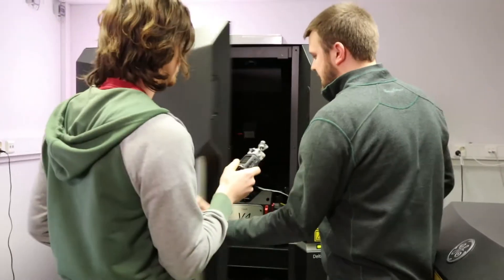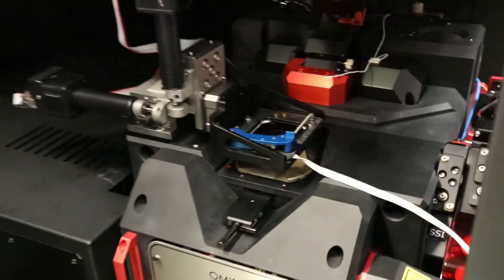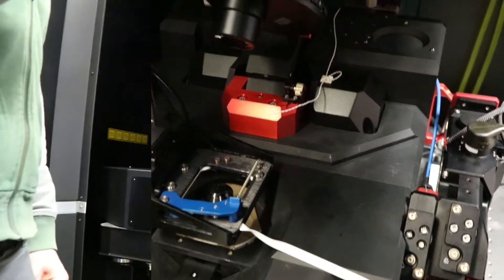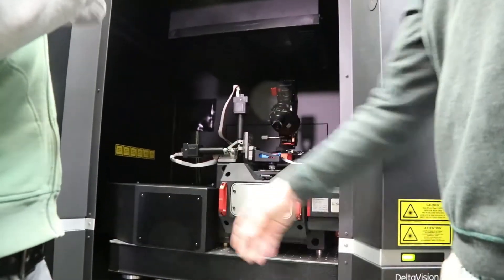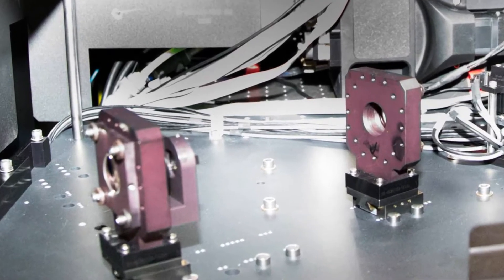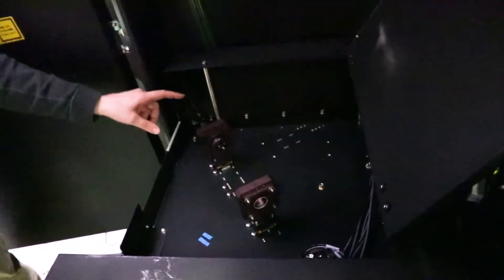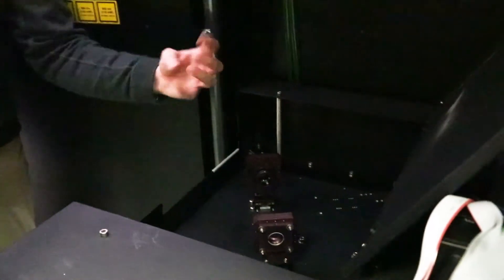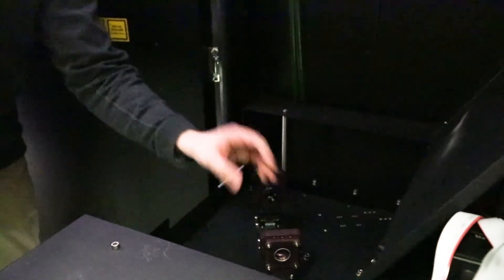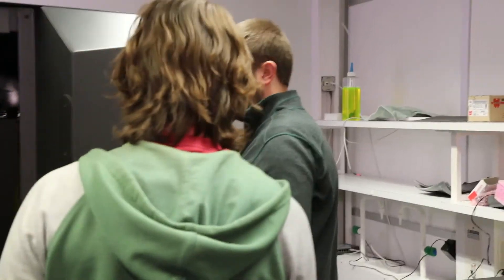This contains the actual microscope block. It's inverted — you put the sample directly onto the oil immersion objective. Underneath this big black dust cover is the SIM light path — structured illumination, that's our super resolution light path, or one of the super resolution light paths. Very high level overview of the SIM path: this is where the fiber optic comes in. The light comes out of here, goes through some lenses. There's a grating in here that splits the light into multiple beams, then some more lenses to start changing the focal point.